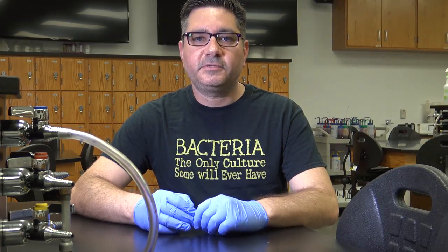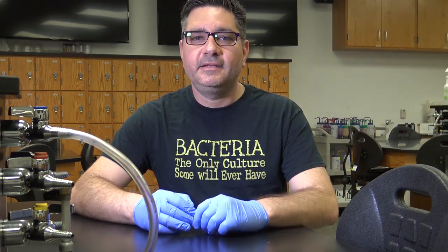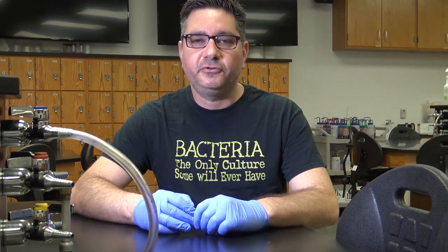Let's now go over the two different states of media, these being liquid and solid media. The liquid medium that we will be using today is nutrient broth. Nutrient broth is a general purpose liquid medium that we will use throughout this semester. Please be aware that there are many different types of broth mediums produced.